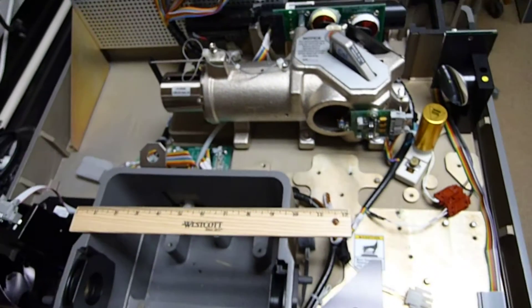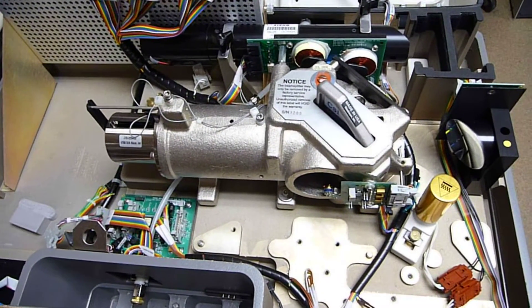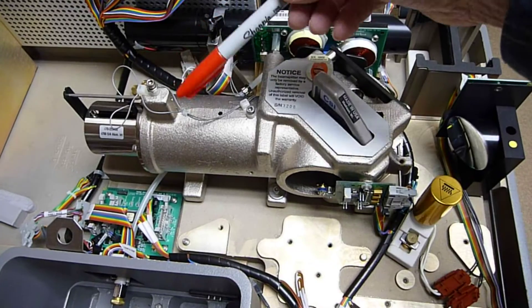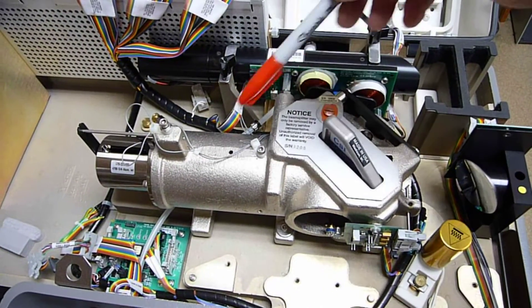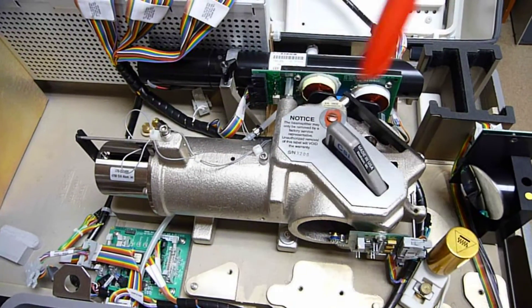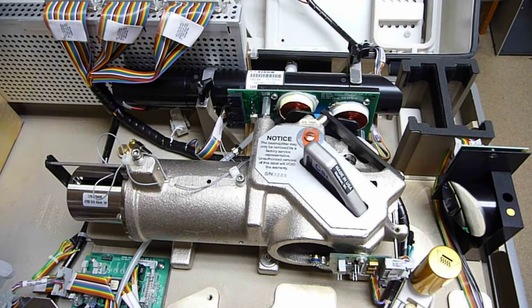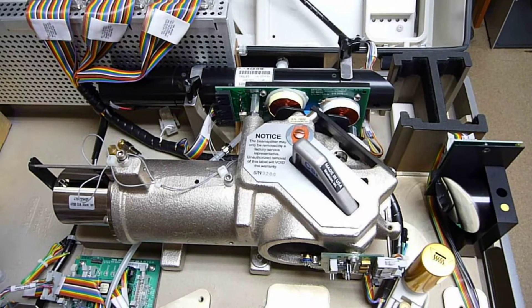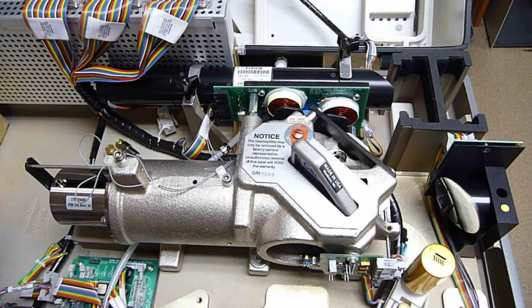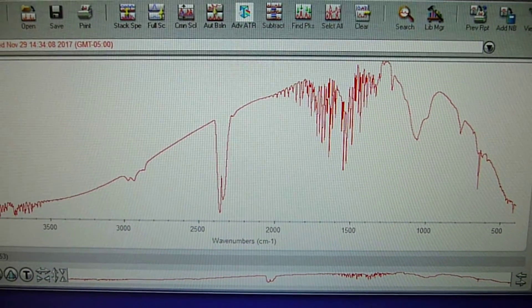So that's what the inside of a modern FTIR looks like. The important stuff here is the movable mirror, which is not moving right now because it's not powered up — it needs some repair work on some tubing on the inside for the air purge. And this is the background IR spectrum.